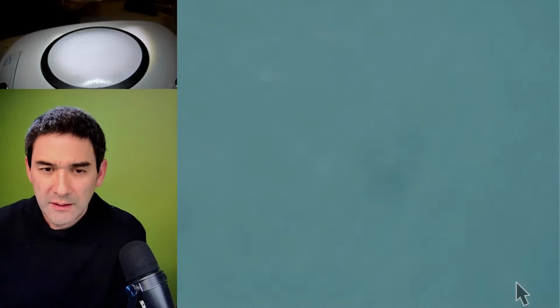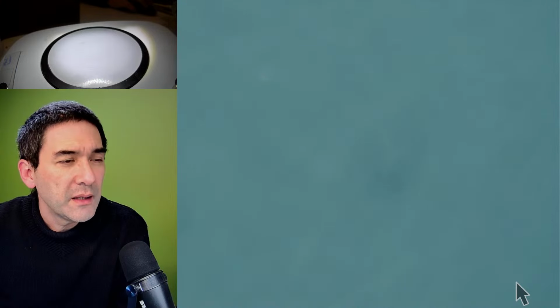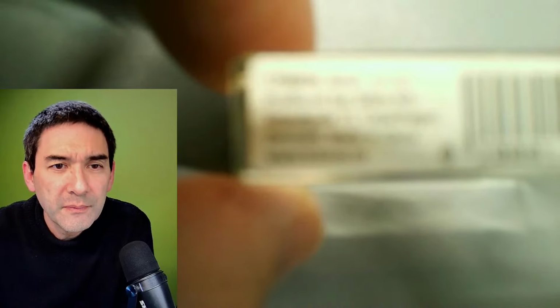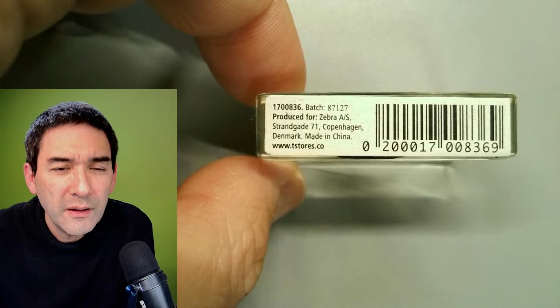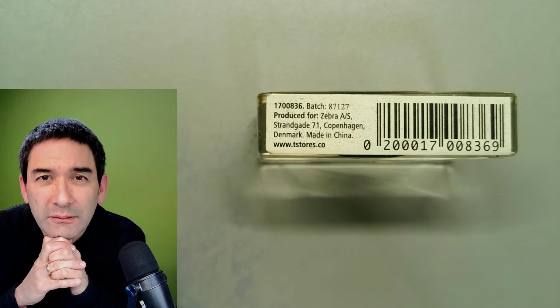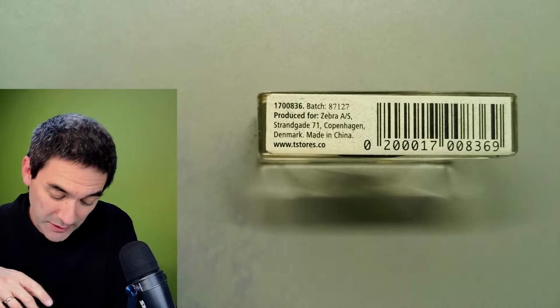So let's have a look here again. Let's have a look again here. Okay, what do you notice? What do you notice? No name of insect. What a pity.